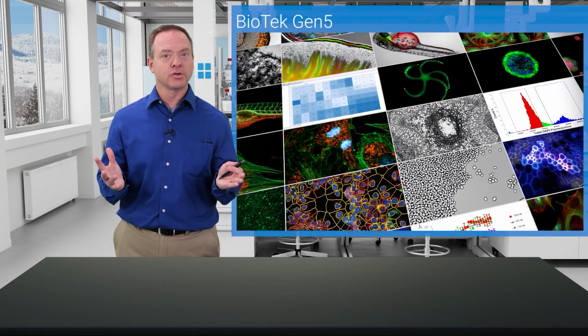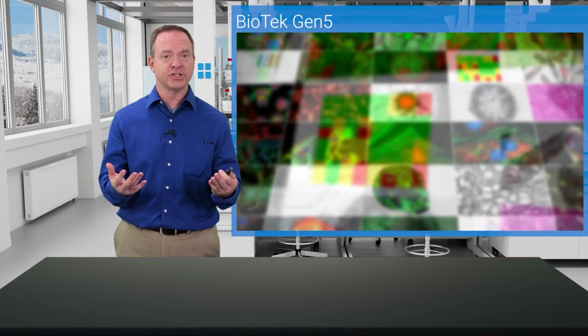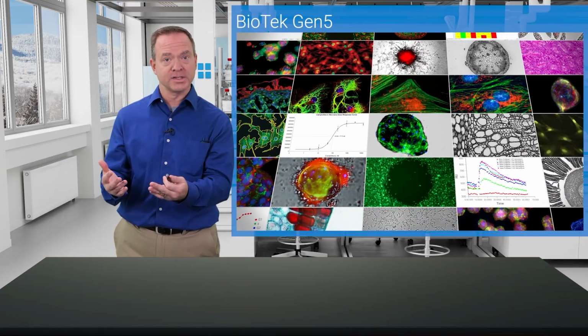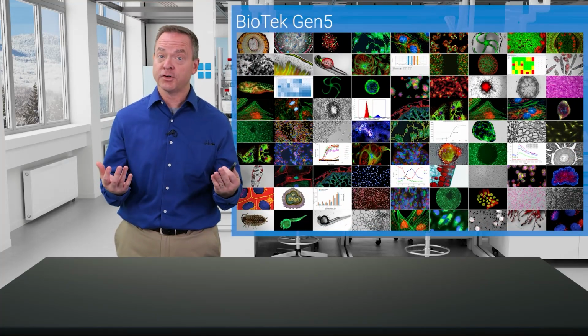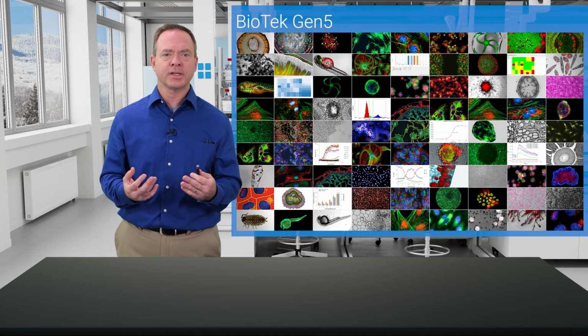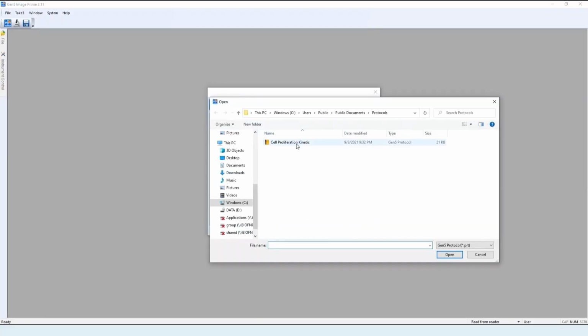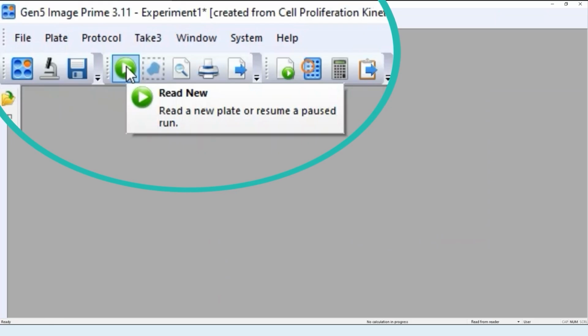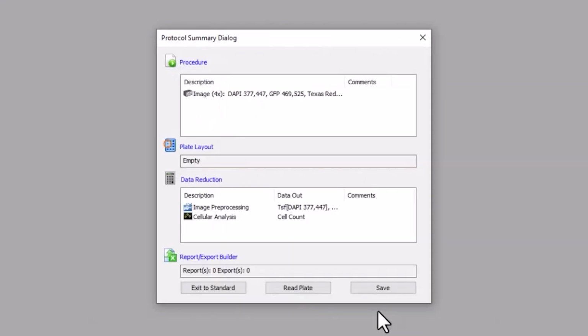The fact that you can incorporate a single software package to help answer each of these questions from broad to focused is a huge benefit when you consider the time and effort that goes into mastering instrumentation software. For users new to Gen5, predefined protocols can be started with the push of a button, or quickly and easily created using the simple feature within the software.